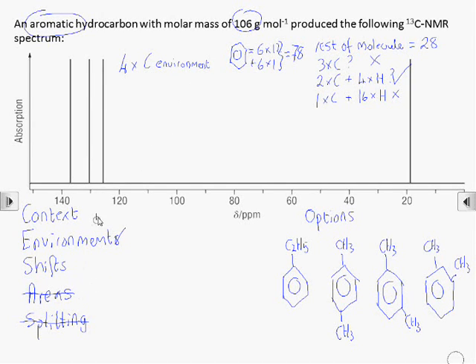And three of those are in the 120 to 140 parts per million region. So those are the aromatic carbons. We've got three carbons that are different to each other that are part of the benzene ring. And then we've got just one carbon environment which is aliphatic, not part of the benzene ring.